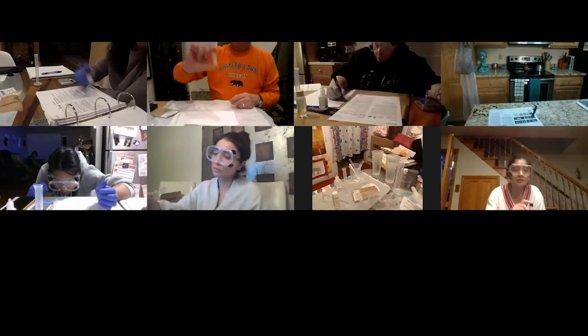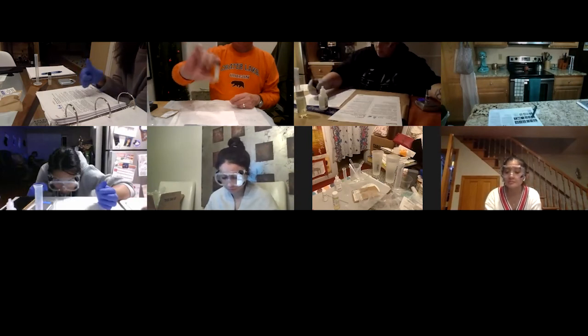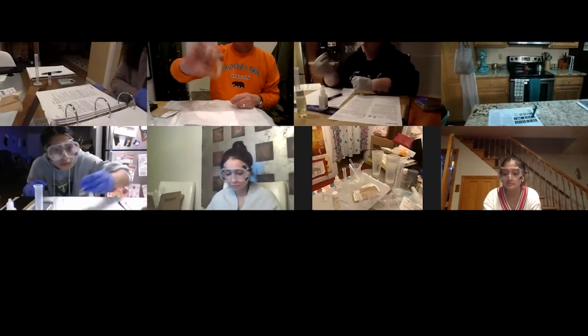What we're hoping to do is to make an emulsion, just like everyone's made salad dressing before, right? Hopefully with oil and vinegar. So you're basically just doing the same thing.